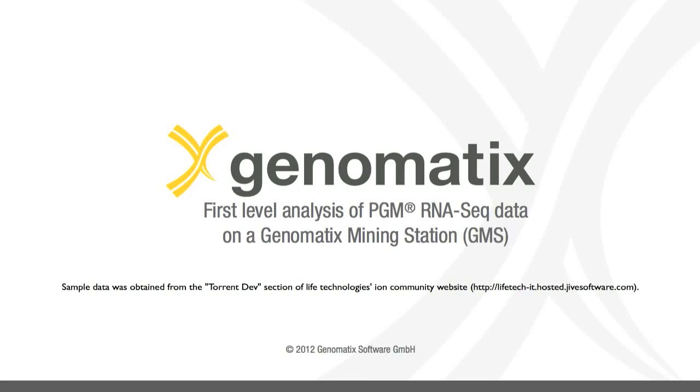In this movie we'll show you how to run a first-level analysis on RNA-seq data from Ion Torrent's personal genome machine on a Genomatix Mining Station.